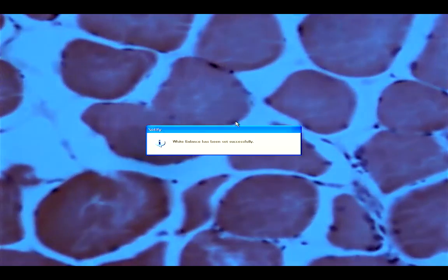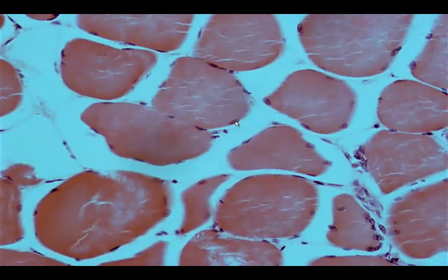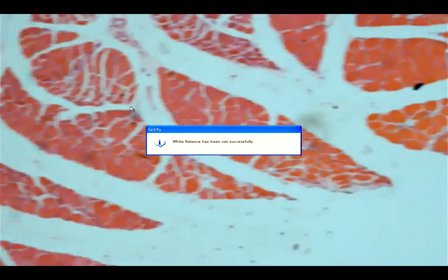Okay, so with regards to the striated muscle, we would be able to differentiate them by the appearance of the muscle fiber. Here you can see that the muscle fiber would contain several nuclei. And where are they located? They are located at the periphery. So peripherally located multiple nuclei, and this would be skeletal muscle. Aside from that, we won't be able to see this one, but we would know that skeletal muscle is voluntary.